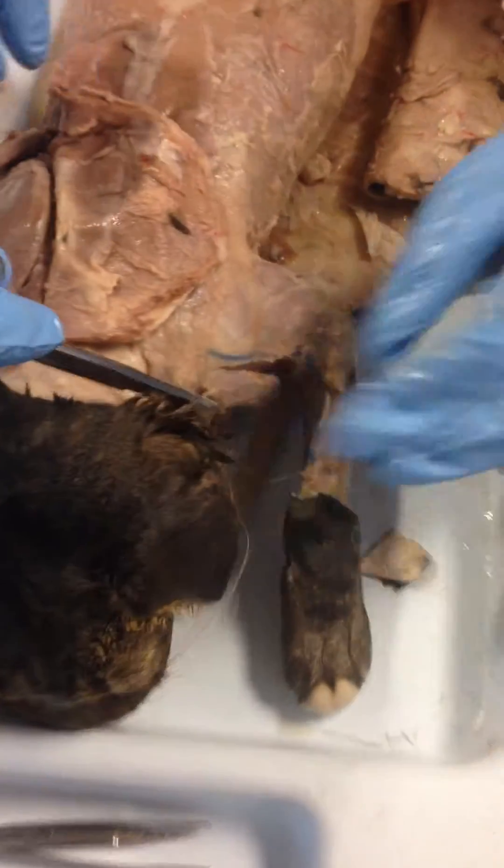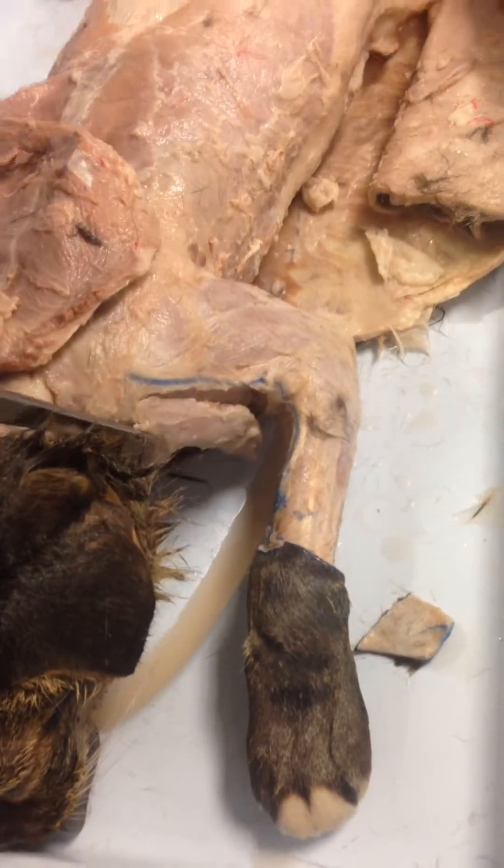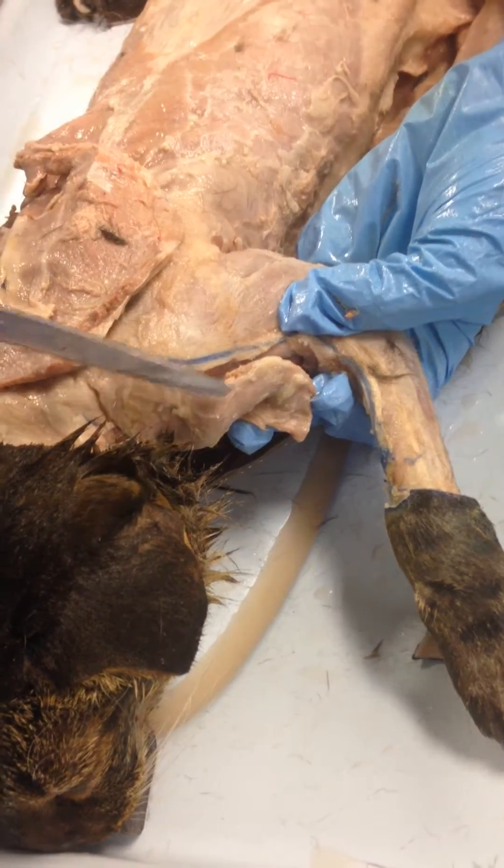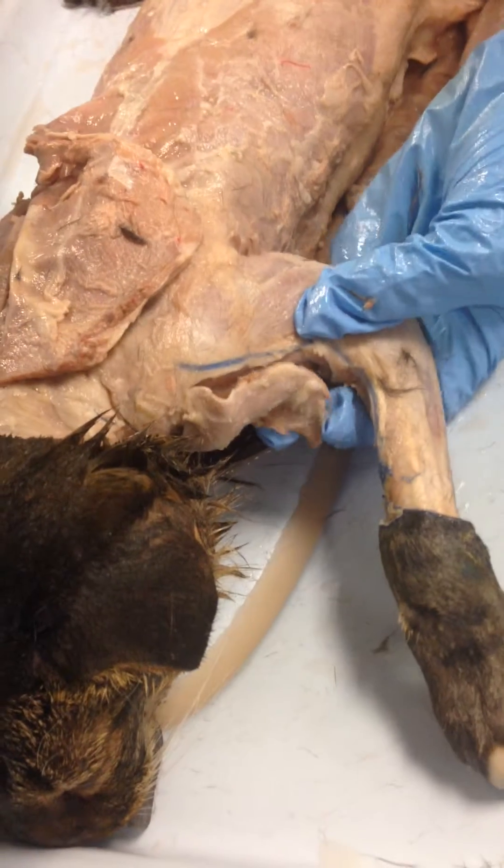I want you to look over here, if you can move over here. This is a better picture. Can you see this muscle here? This is the deltoid. There's the deltoid.